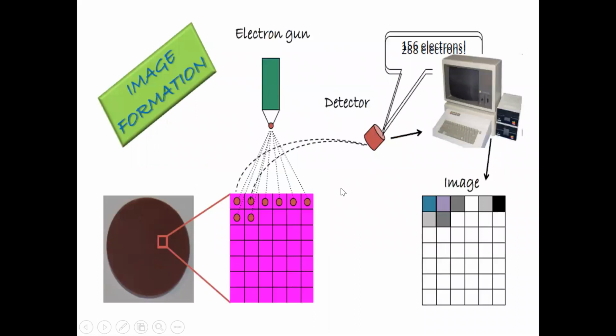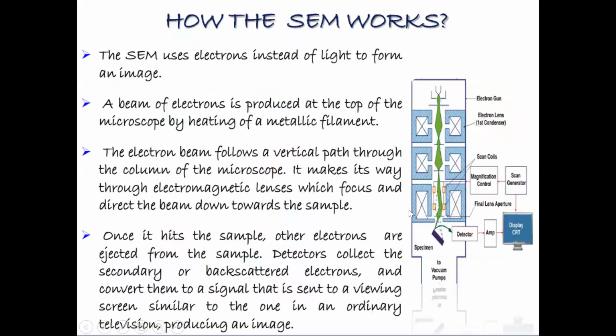This is also one of the image representations of the SEM schematic diagram. The electron gun strikes on your sample, and the detectors give us the signals, which are amplified, and then it comes as an image on your computer. Now what is the exact working of your SEM? तुमचा सेम कशा पद्धतीने, आता आपण इथं इलेक्ट्रॉन गण आहे तो पास होतो इथून इलेक्ट्रॉन्स इथे.